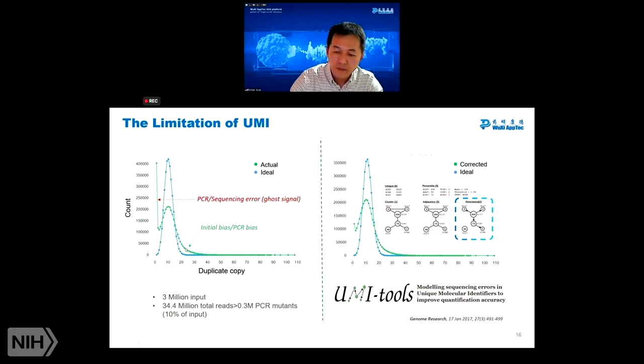First, you will notice there is some dispersion here. This is normal because when you order a UMI, the random sequence, from a vendor, nobody can guarantee a truly even distribution of all the sequences. There is always a slight bias towards A's or T's and so on and so forth. But there is another population, as you can see, very profound in this example, that has low copies, but it's a big population.